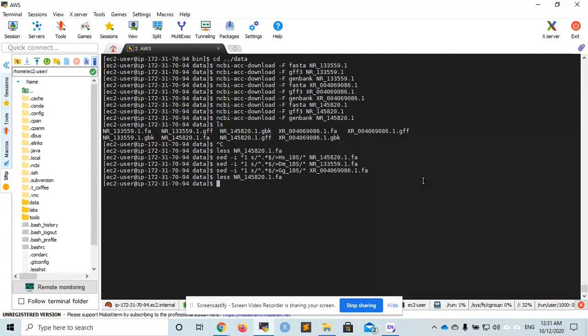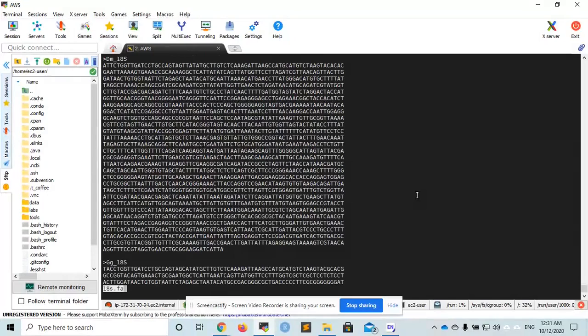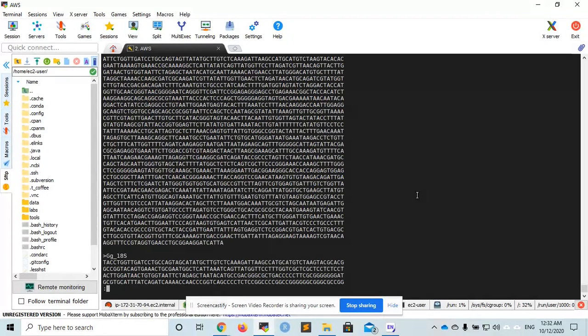I will concatenate these three sequences using the command cat, concatenate, into a new file called 18s.fa. This is a multi-fasta file.